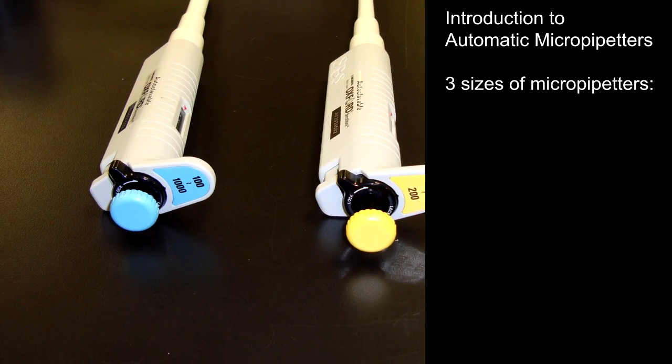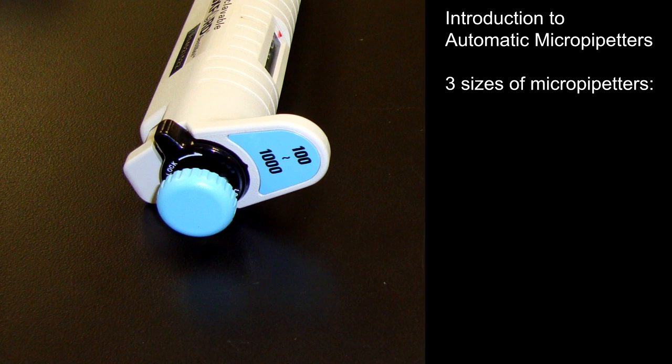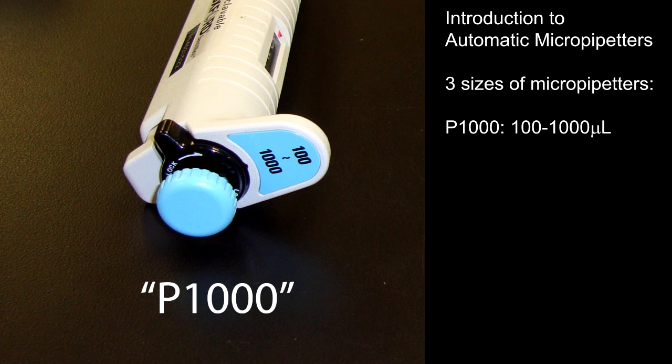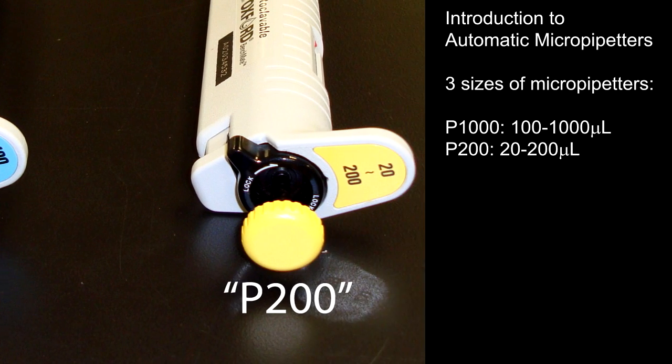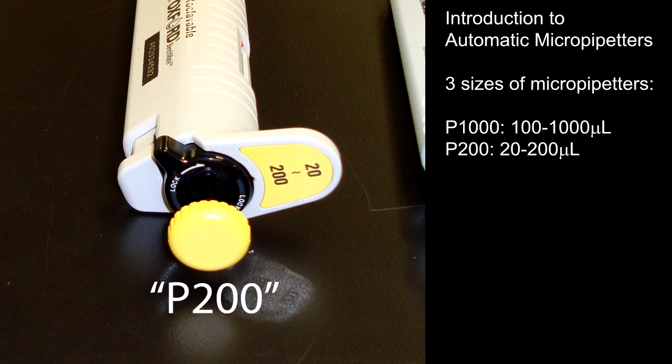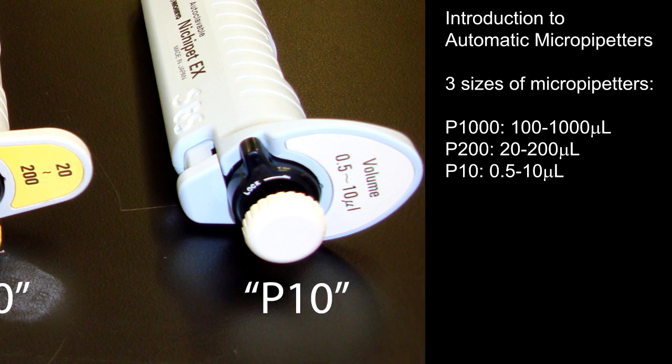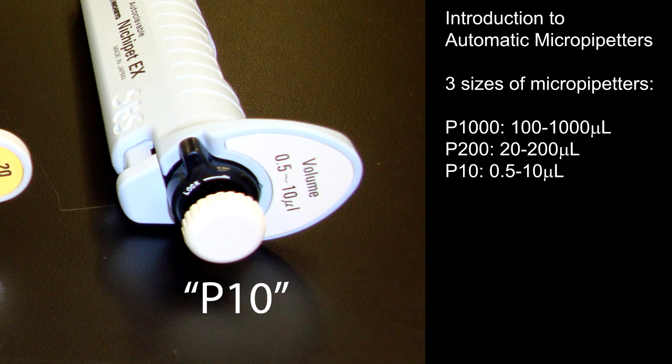You should be familiar with operating three sizes of micropipettors: the P1000 for 100 to 1000 microliter volumes, the P200 for 20 to 200 microliter volumes, and the P10 for 0.5 to 10 microliter volumes.